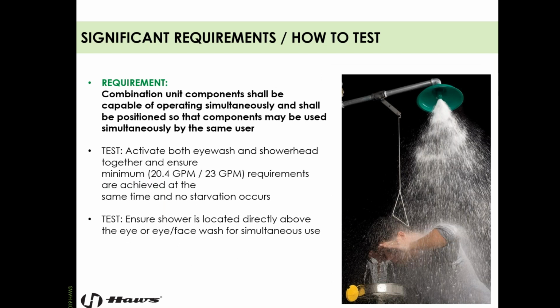Combination unit components need to be capable of operating simultaneously and need to be positioned so that the components can be used by the same user at the same time. I say this every time, but for some reason, plumbers throw away the instructions like step one.